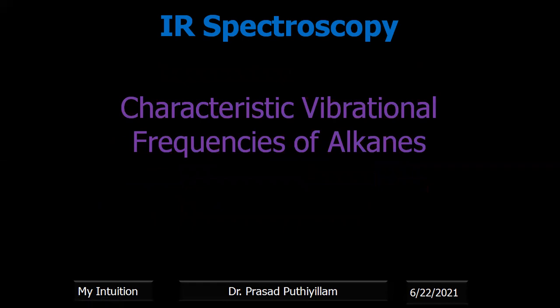Now we are starting with the characteristic vibration frequency of alkanes. Before that, how do we usually do the IR spectroscopy analysis to find out the different functional groups or bonds present in an organic compound?